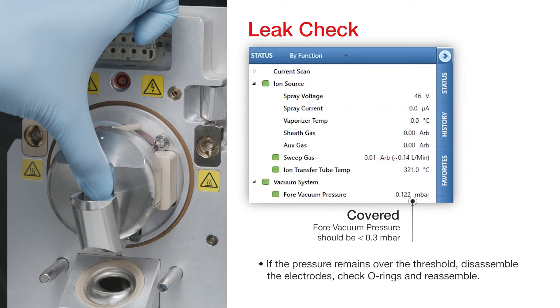If the pressure remains over the threshold, disassemble the electrodes, check the O-rings, and reassemble.